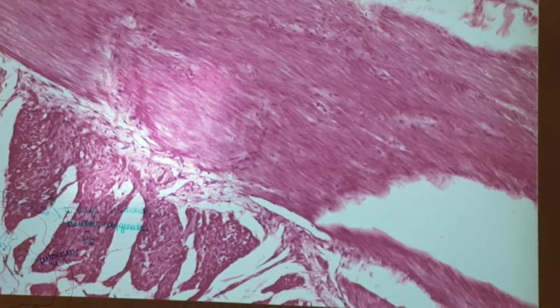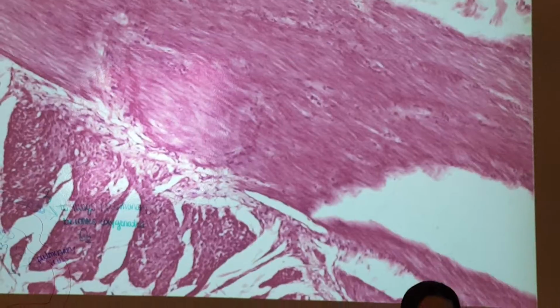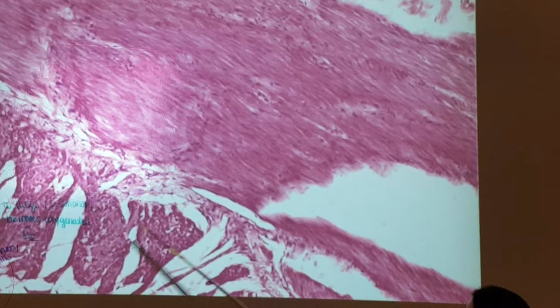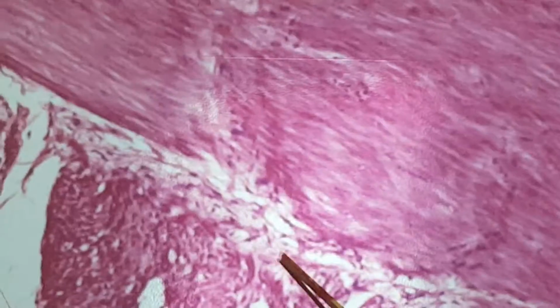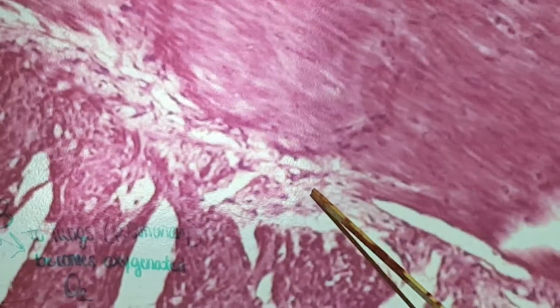Another thing we're going to look at that's not on the ileum list, but it's on the colon list, but you can see it here, so I'm going to show it now. It's always between the circular and longitudinal layers. This is the ganglion of the myenteric plexus, that nerve network that sits between the muscle layers to help them move and contract.